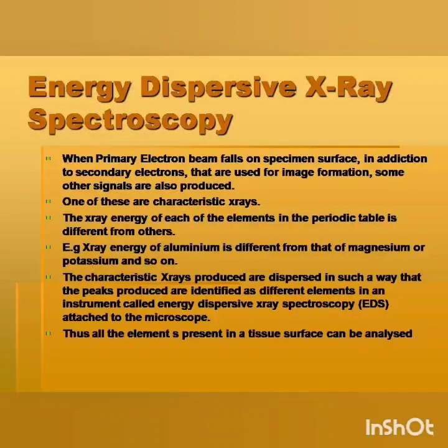In addition to imaging, electron microscopy has another device through which one can study the elemental composition of the specimen. This is called energy dispersive X-ray spectroscopy.